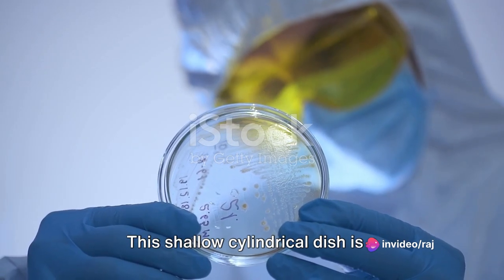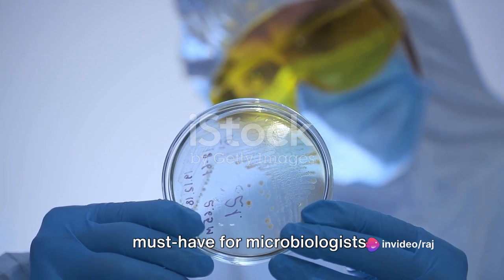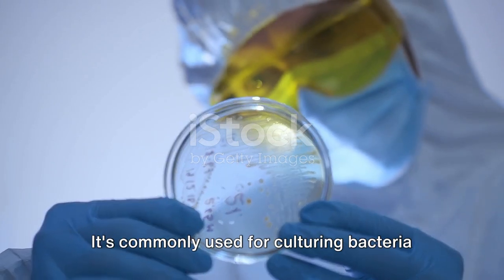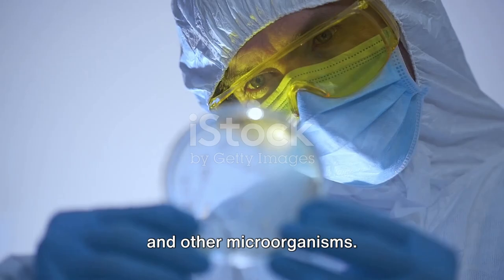Now, let's talk about the Petri dish. This shallow cylindrical dish is a must-have for microbiologists. It's commonly used for culturing bacteria and other microorganisms.